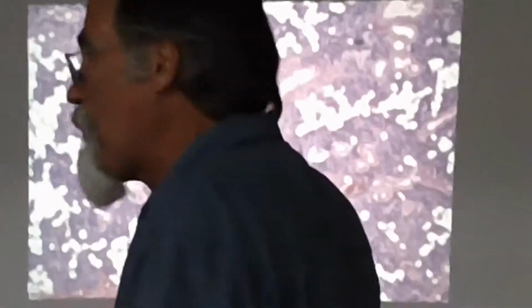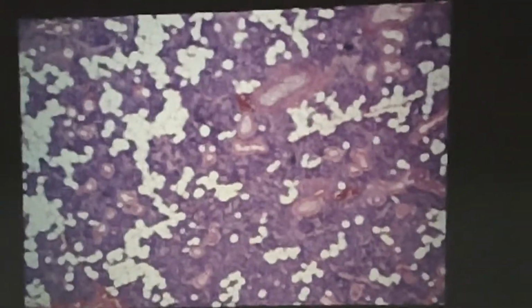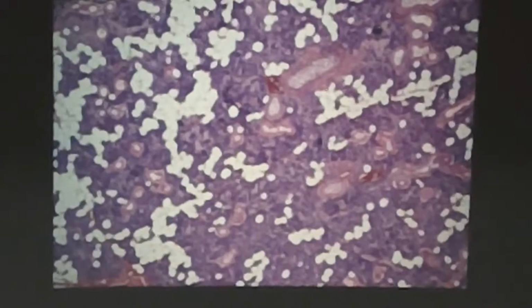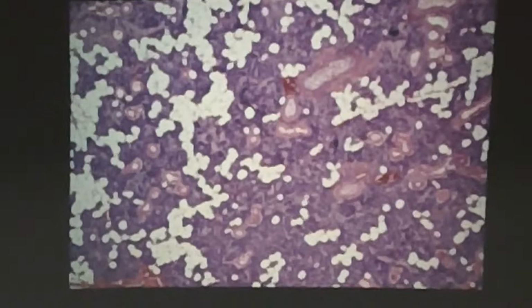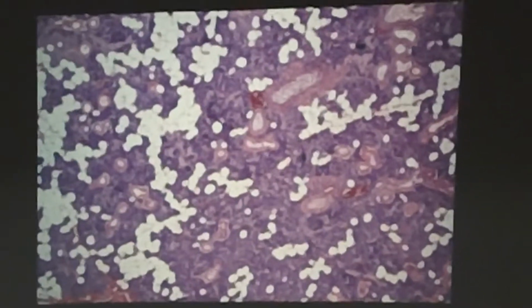But all you see are serous acini. If you look throughout the whole slide, that's all you see. So, we've got some tissues like liver and gallbladder, and then we've got the dreaded purple: the parotid, submandibular, pancreas, and parathyroid. All right? For those slides, I'm going to be yakking at you about distinguishing features, and we started here. So one distinguishing feature is presence or absence of ducts, because that marks it as exocrine. All right? So as Garrett said, clearly we've got ducts, and all we can see are serous acini.